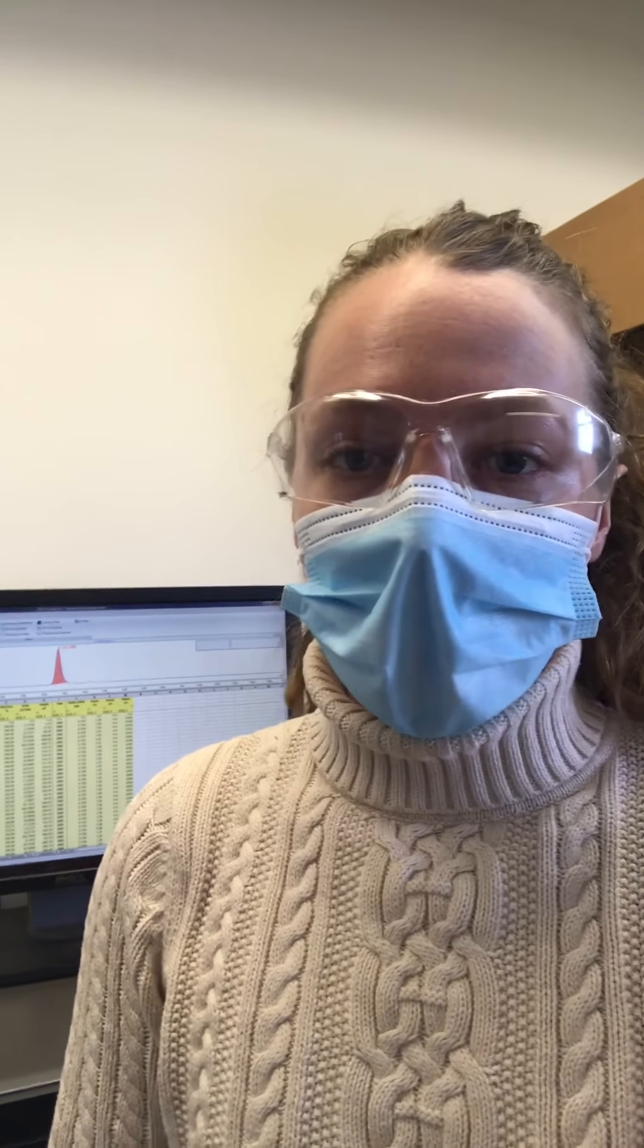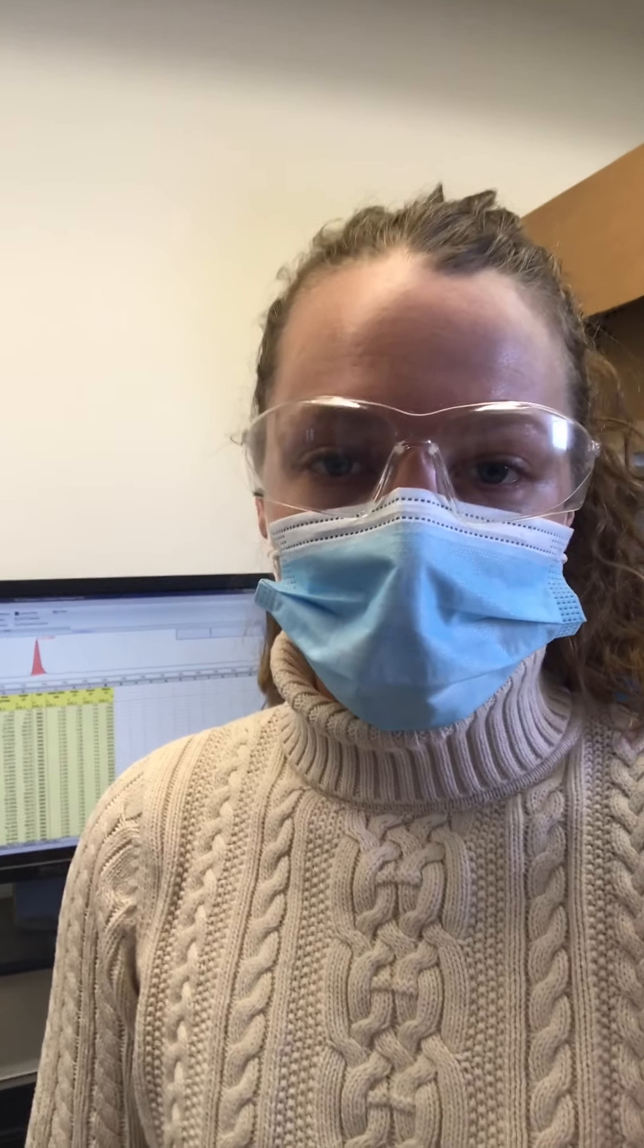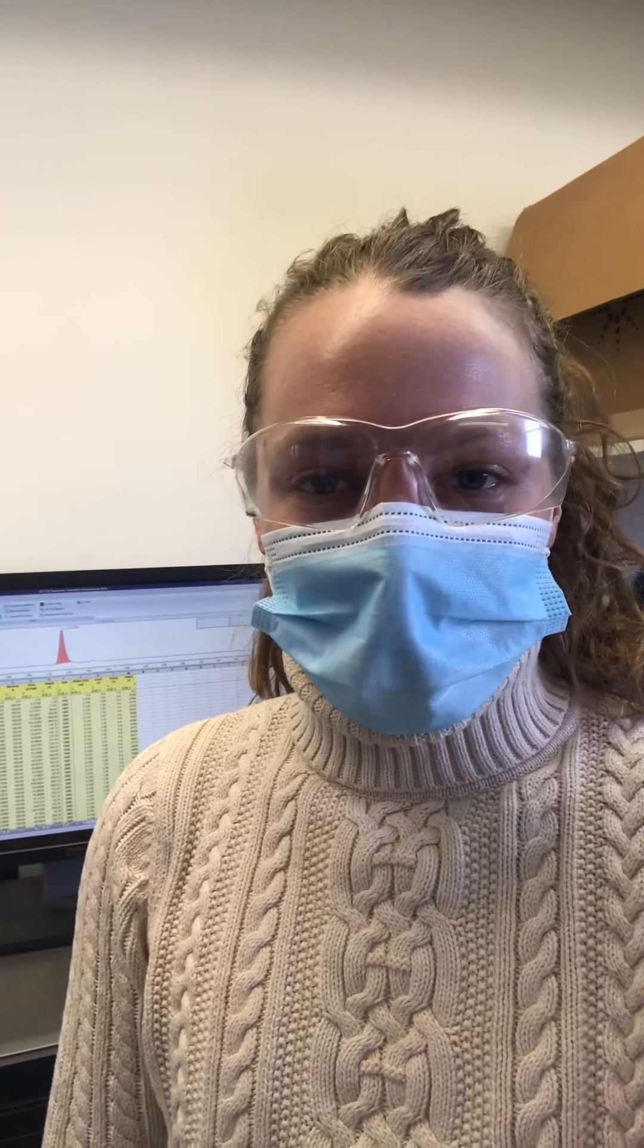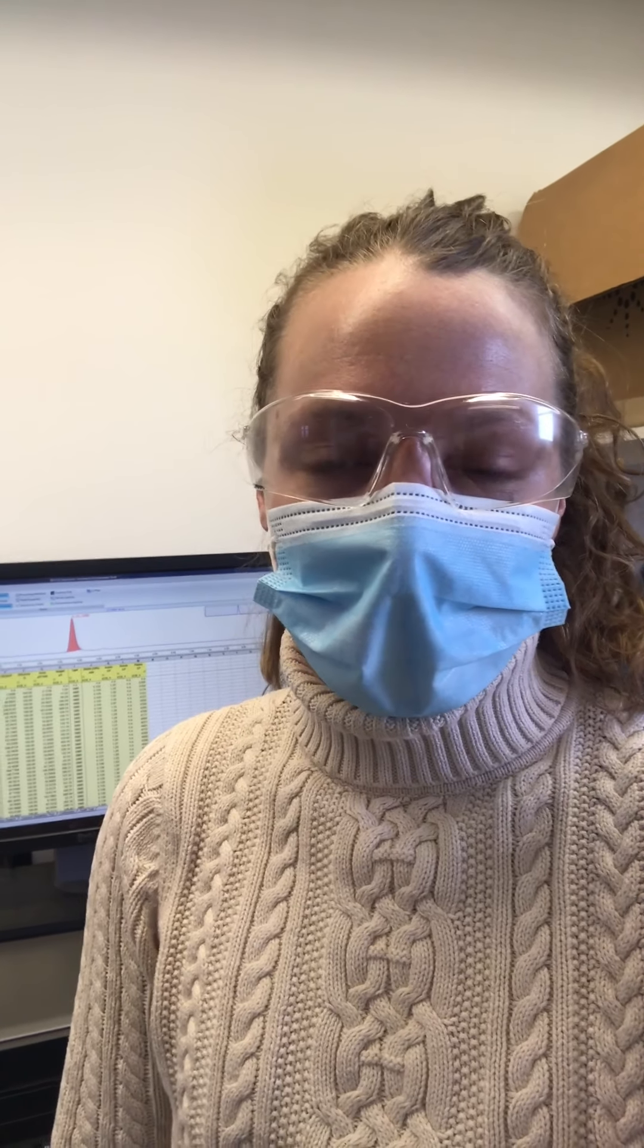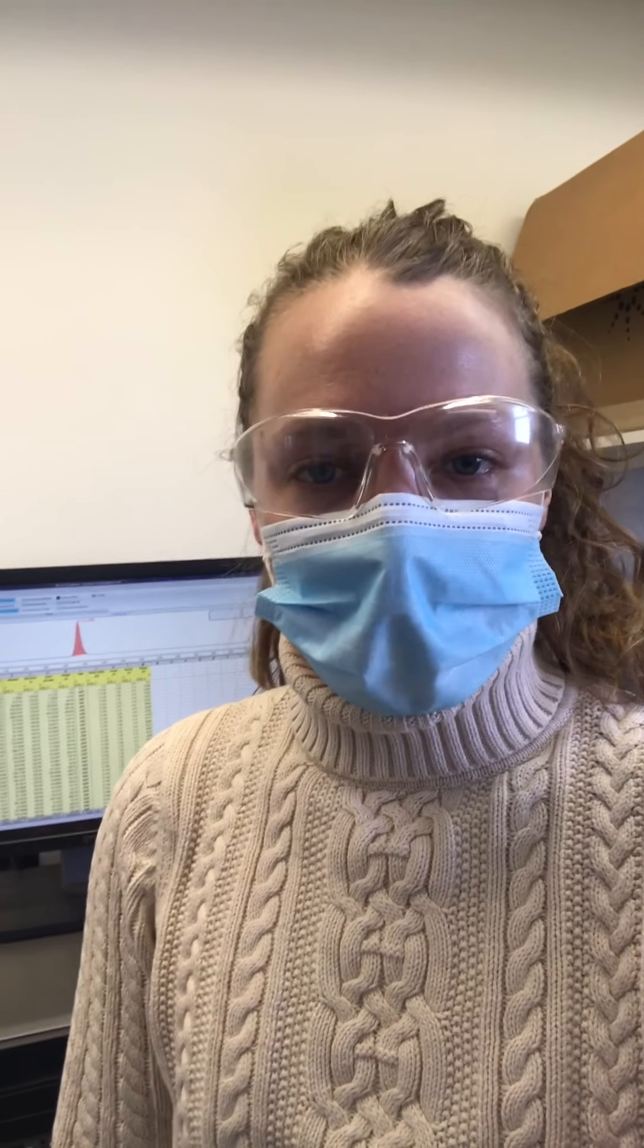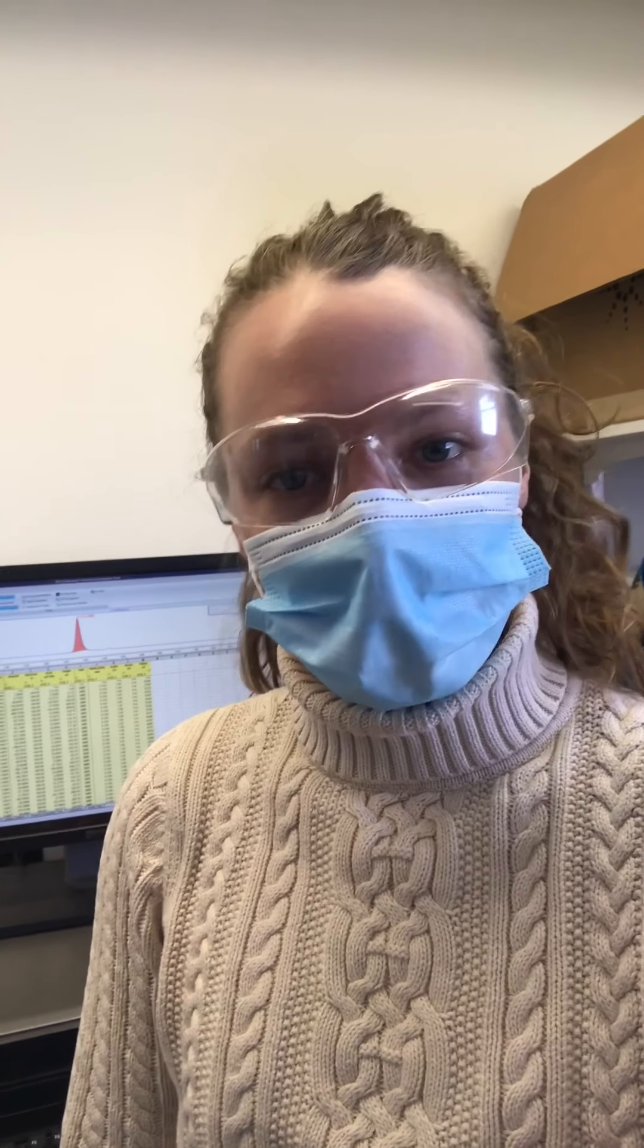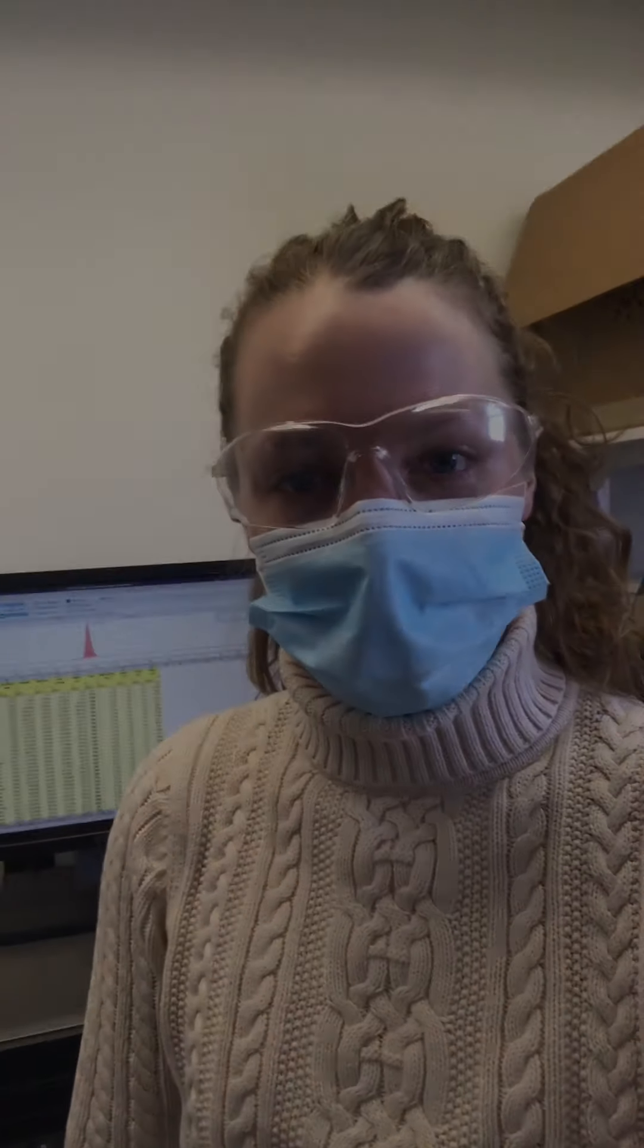After I collect all my data, the last thing I do at the lab is make sure to clean up the ion chromatograph so it's ready for the next user. I run some ultrapure water through the machine and discard all my vials and make sure there's no errors or leaks that I need to report to the lab manager. So that is what I do in the lab. The next steps are to take the data home and process it and see what it looks like compared to other values I've collected throughout the year.